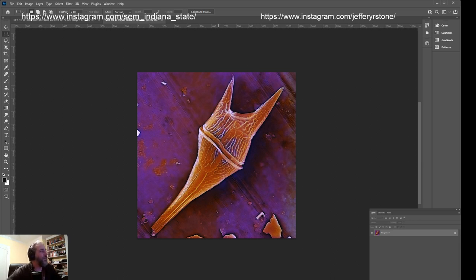So here we go. We started with a black and white image of this thing, and now we've already got a nice colored image in relatively few steps. This one, as I said, we used the style transfer tool. You can use the colorize tool if you'd like. You can also skip all of those options. You don't necessarily need to use the high-end tools. I think they actually add a lot of depth, so I really like using them. It's usually where I've been starting a lot recently. And then I just play with colors until it gets my interest and it's not obnoxious. But this is basically my current plan, how I go from a black and white image all the way through to color.